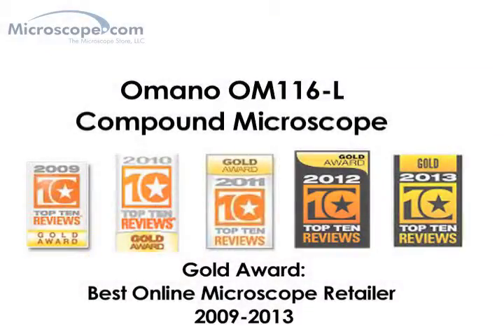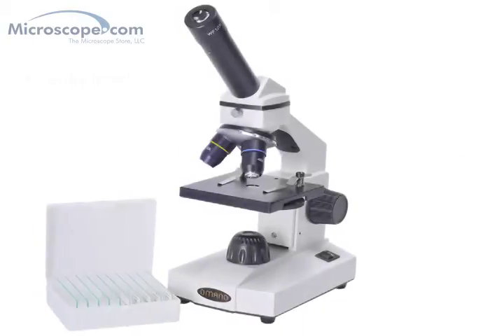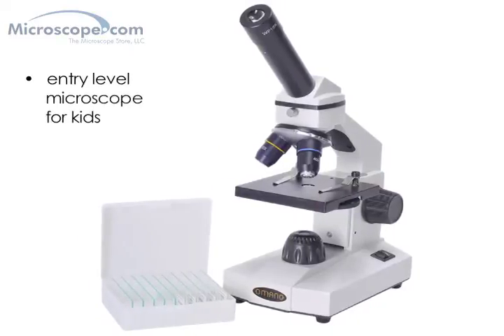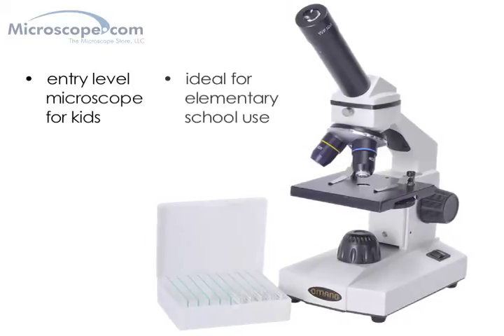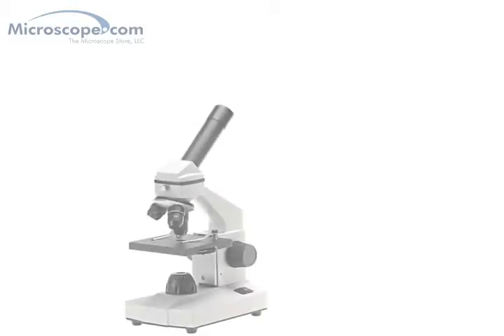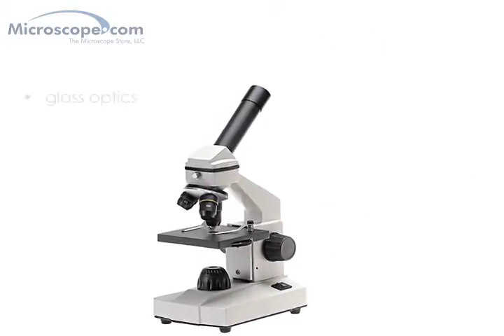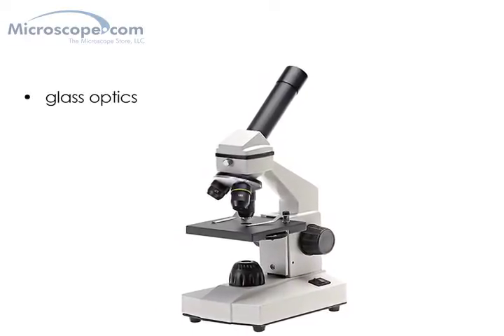The Omano 116L compound microscope is our entry-level basic compound microscope. This is a great starter microscope for kids and provides a great opportunity for them to explore the hidden world of microscopy while keeping your investment reasonable. This system is also very popular with elementary schools, providing a great mix of features and value for school biology programs. The Omano 116L provides a real microscope experience with good quality glass optics and a clear view, and it does so without breaking your budget.